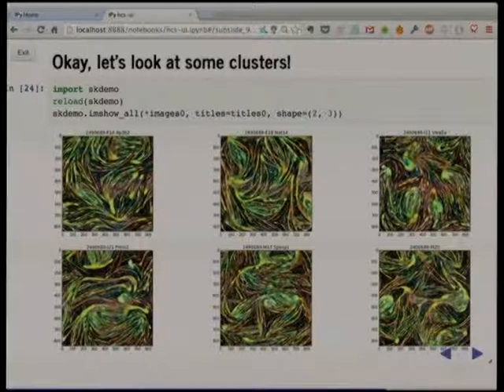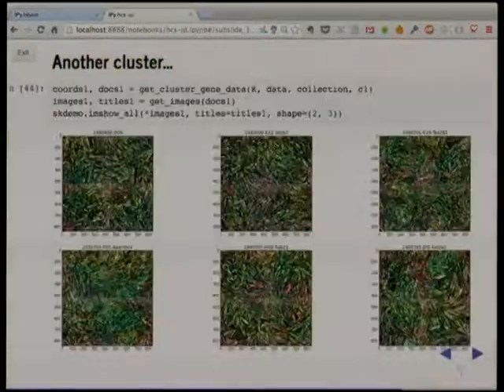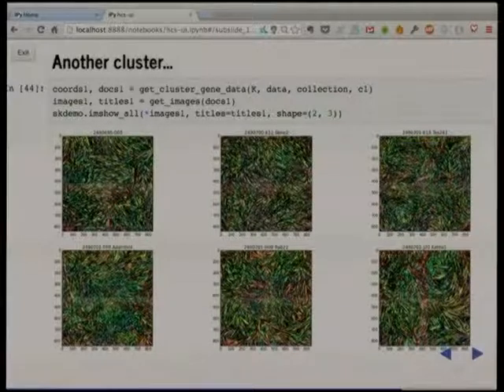You don't have a baseline for how similar they are, but they do have similar features, right? And if you look at another cluster, you can see that they're completely different to that previous one and quite similar to each other. Right? So that is the main message from this talk, is that you can do something really simple, borderline stupid with your data, and still get useful results if you do this sort of don't care feature extraction approach.